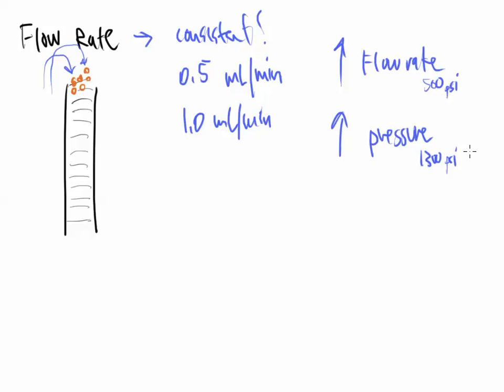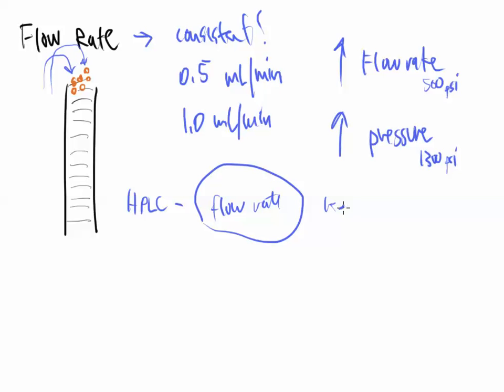When you start looking for lab experiments, or maybe you already have a lab experiment, and you're looking at HPLC methods, you're often going to see a flow rate that's listed. The flow rate is a requirement. They have to report how fast they have sent a sample through the machine. And you are going to have to do this as well.